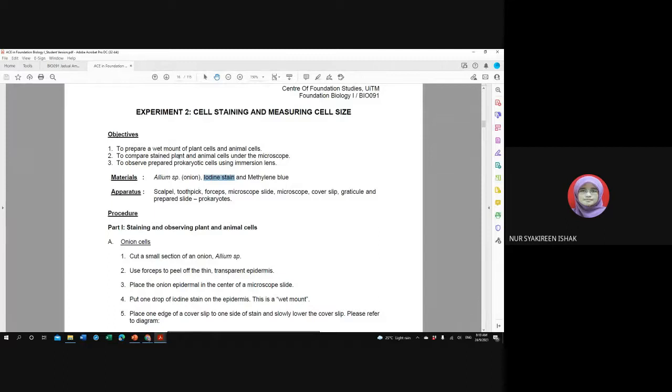Okay, the microscope slide where you place your specimen, the plant cell, and also the cheek cell, and then on top of the cells, the specimen, you are going to drop a few drops of the dye. Okay, and then you are going to cover with a cover slip before you place your slide that has your specimen onto the microscope stage.